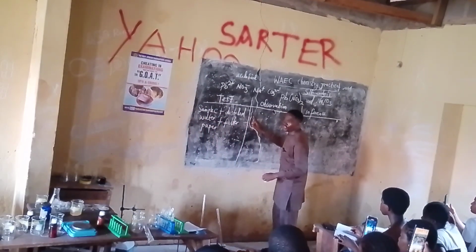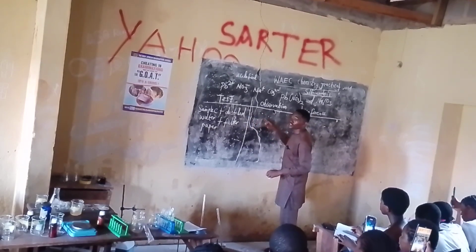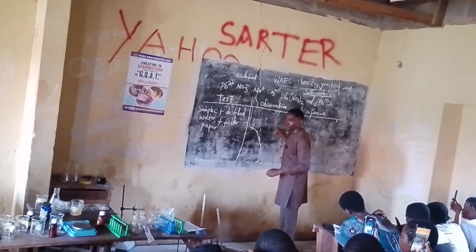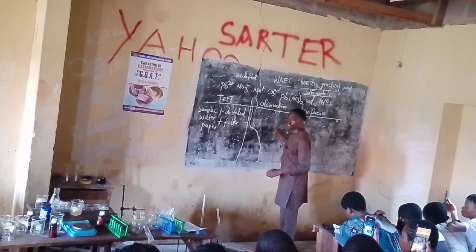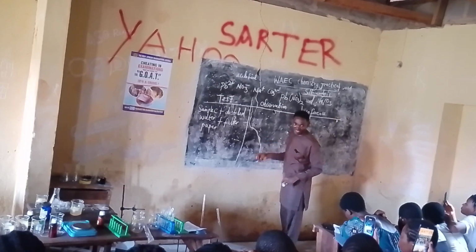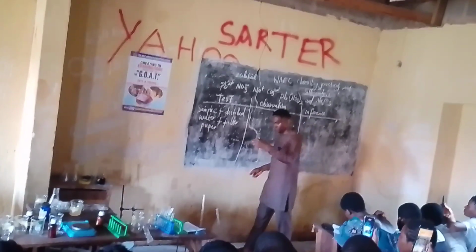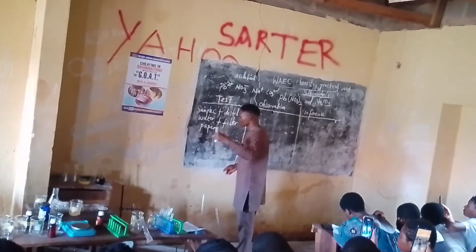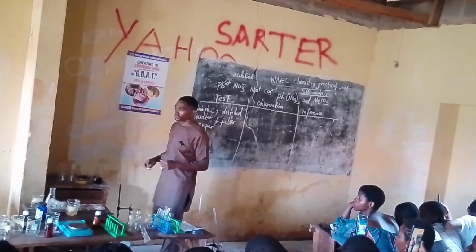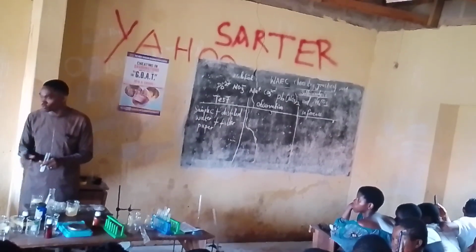In observation, you say sample C dissolved partially. Okay? Sample C dissolved partly or partially in distilled water. It still will not dissolve. Some portion is insoluble.